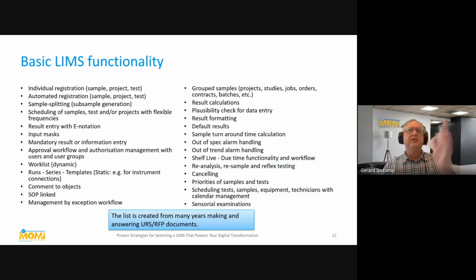For the basic functionality, I have here part of the list of functionalities that you can find there. That goes from input masks where you can only put in numbers or something like that, or mandatory results, or comments to objects, or shelf life, default results. Now, you get the PDF, so you can use this list for your own situation and see what is applicable and what not.